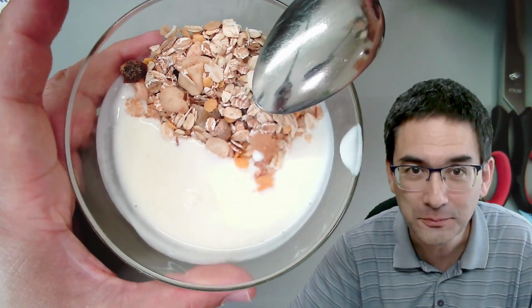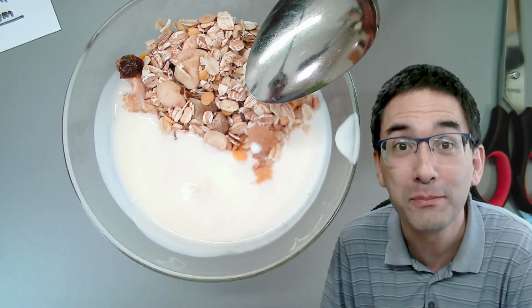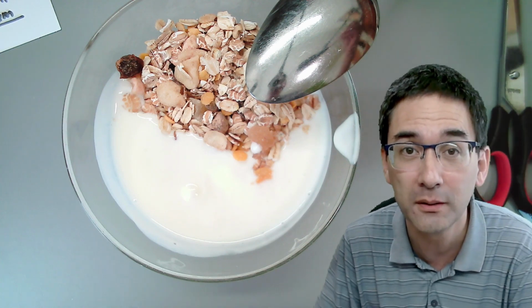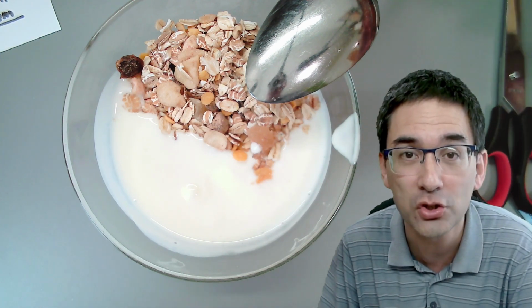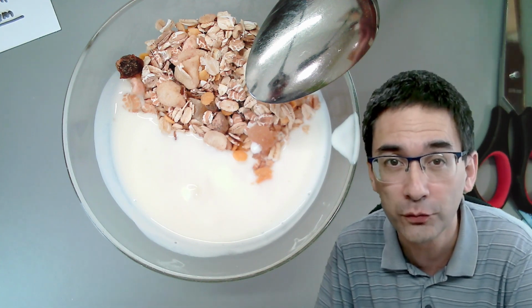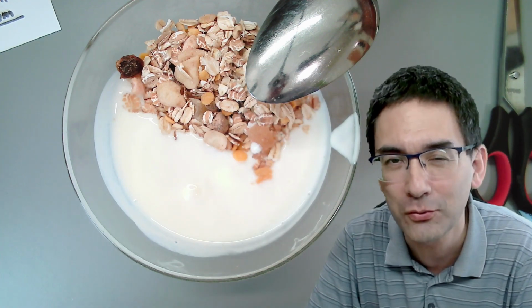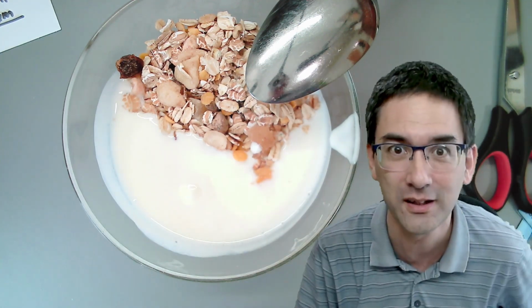because of course in yogurt you have billions of bacteria. Yes, you add bacteria to milk, and then the bacteria, so-called lactic acid bacteria, start to divide and reproduce, and they convert the milk to yogurt. And I think it's a very nice thing to put under the microscope. So let's see if I'm able to find some bacteria in this yogurt. And yes, sure I am.